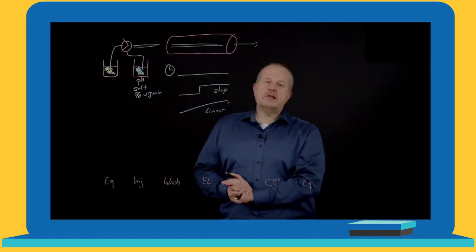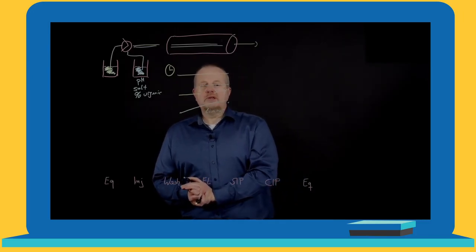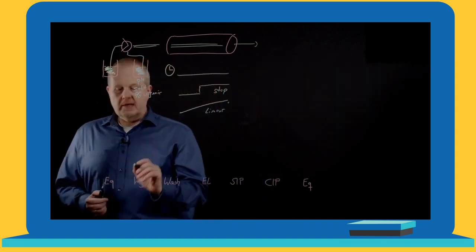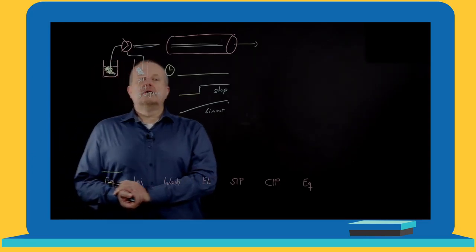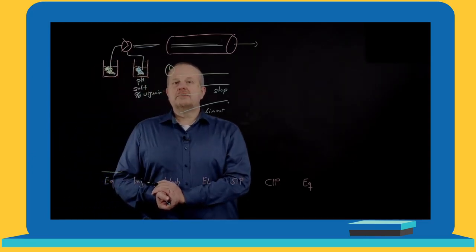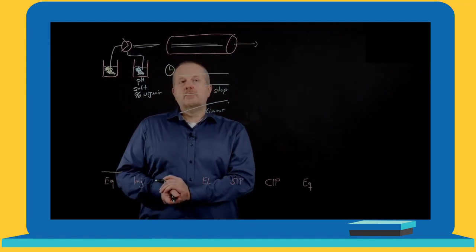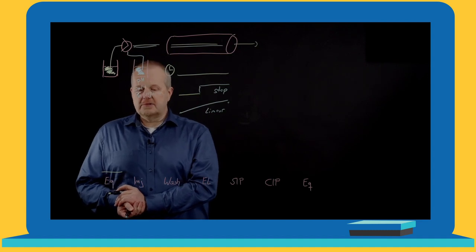And now we take this system and bring it to a real chromatographic system. So we start in our column with an equilibrated column, an equilibrated system. So we have the initial conditions of our mobile phase, which is there in the whole column system.